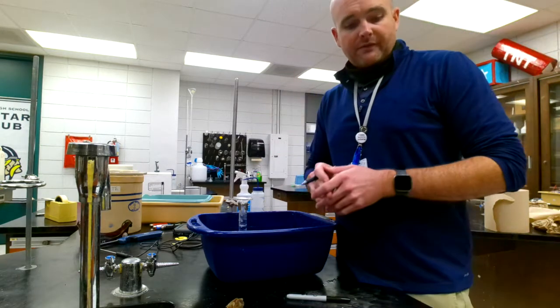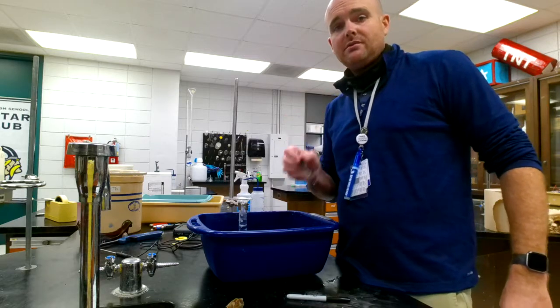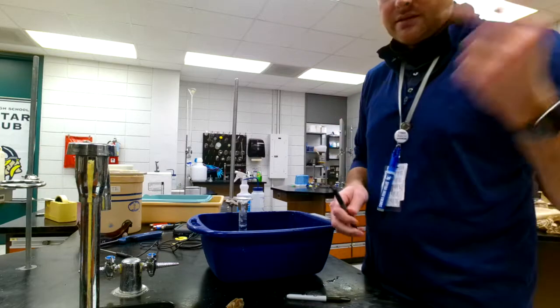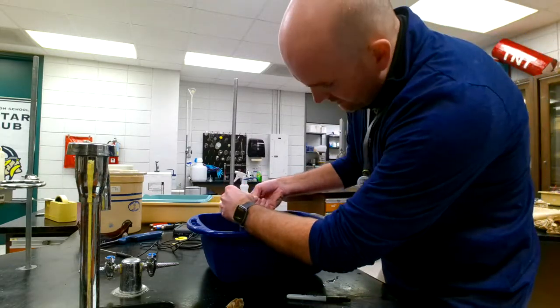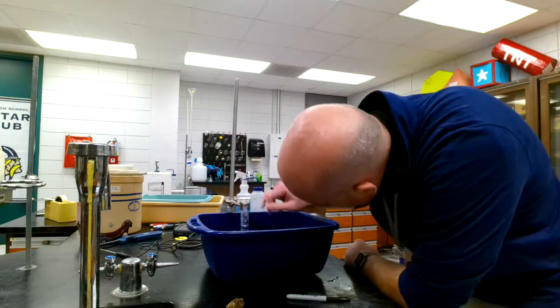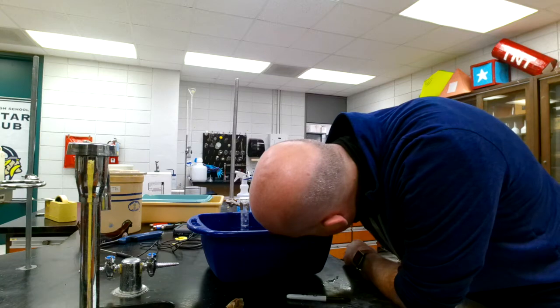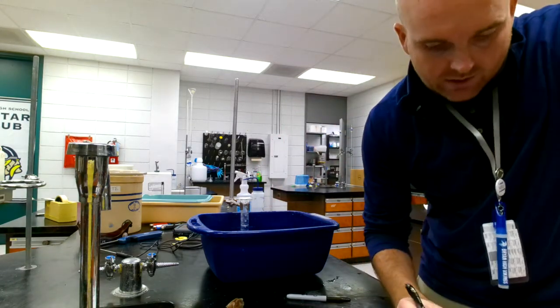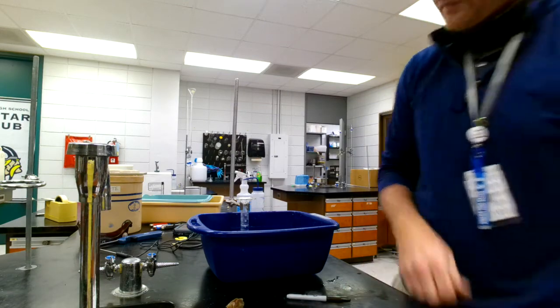Okay, the final mass of that one was actually 29.2952 grams. That's because I put more gas in here, so it makes sense that the mass would go down a little bit more. So let's take a look. 5, 10, 15, 20, probably 21.1. 21.1 milliliters of gas there.